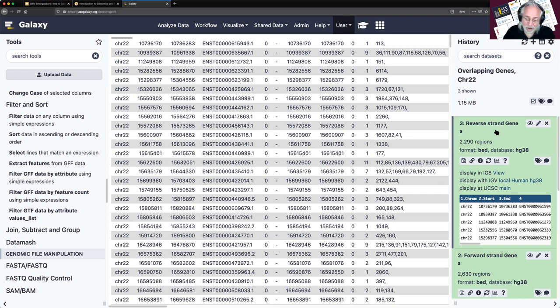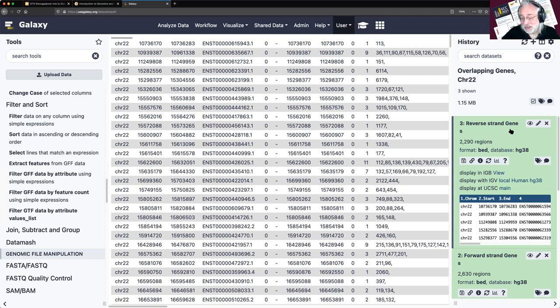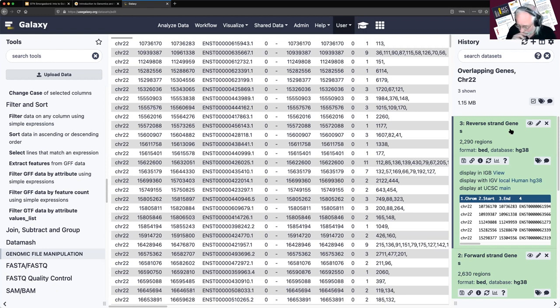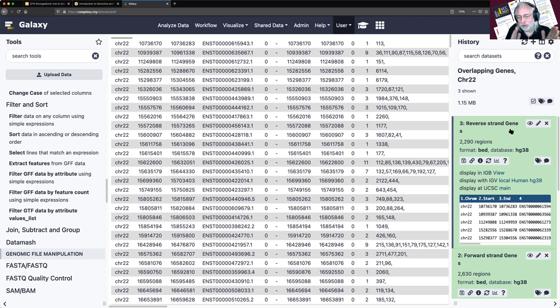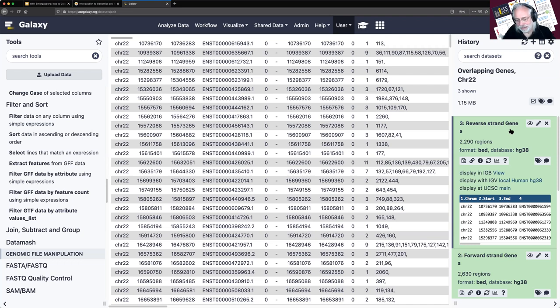We've now got the first part of our process — we've split it. Now we want to check for overlaps. When Galaxy was young, one of the very first sets of tools was 'Operate on Genomic Intervals,' and it does exactly what we're looking for. Genes are genomic intervals — they're on a chromosome with a start and stop. There are tools in Galaxy that do set-theoretic operations on different datasets.